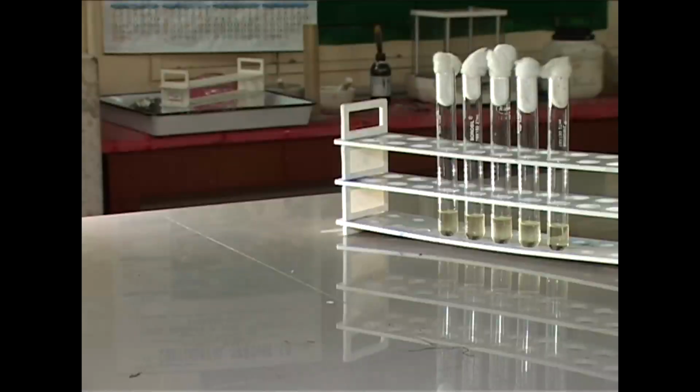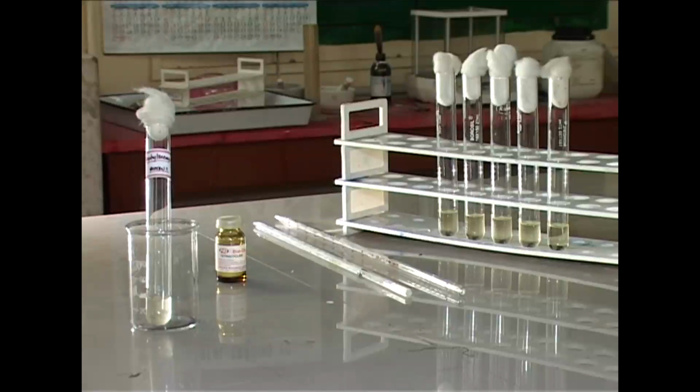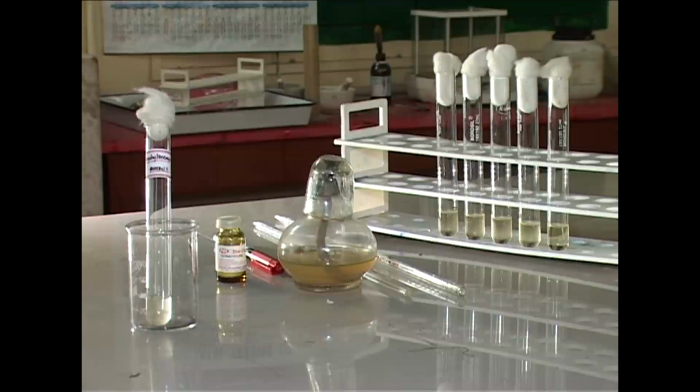The other method for determining the antimicrobial resistance of bacteria is MIC. MIC stands for minimum inhibitory concentration, and it is also known as the broth dilution method. We require a nutrient broth solution dispensed in sterile test tubes. We require a pure culture, that is Staphylococcus aureus, and a standard concentration of antibiotic. We require sterile 2 ml and 10 ml pipettes. We require a spectrophotometer, glassware marking pencils, a spirit lamp, etc.